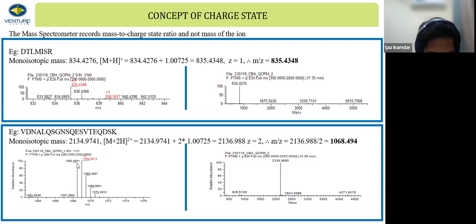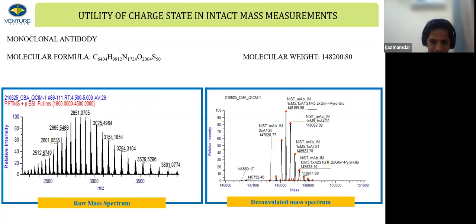And this is what I'm getting in the raw spectrum. The instrument is saying that this is the peak and this is the charge state of the molecule. Now there is something called deconvolution. I will deconvolute this and get the actual mass. So the actual mass comes to be around this. Here the scale was m by z, and here the scale becomes mass because I'm stripping the charge state to 0. I'm making a difficult topic simple, but this is the essence of it. The best part is that all of this is done automatically. You don't need to worry about it.